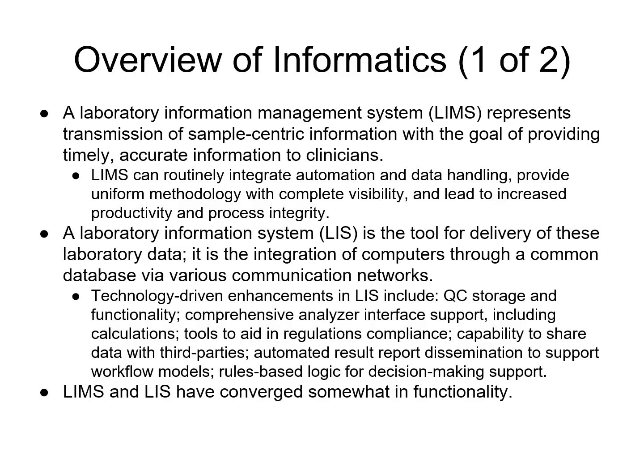Laboratory Information System, also known as an LIS. So, Laboratory Information Management System is an LIMS, and it manages sample-focused information to provide timely, accurate data to clinicians. It integrates automation and data handling for consistent methods and improved productivity.